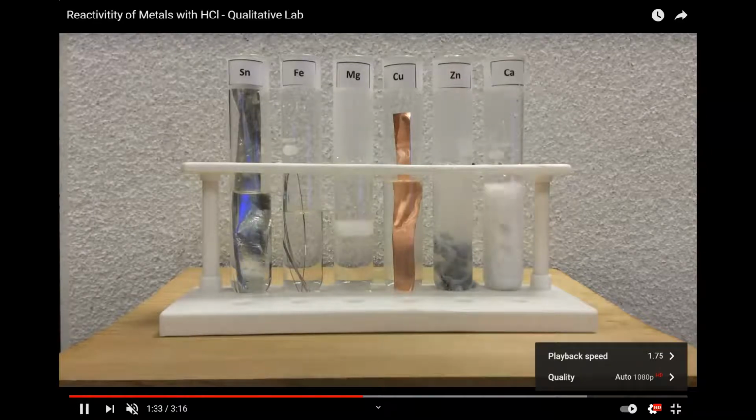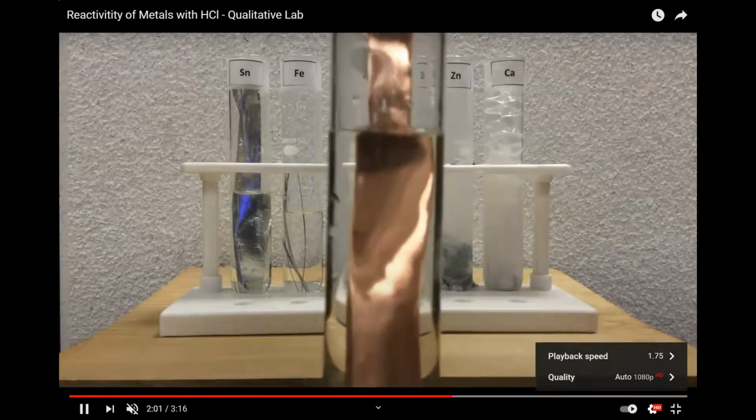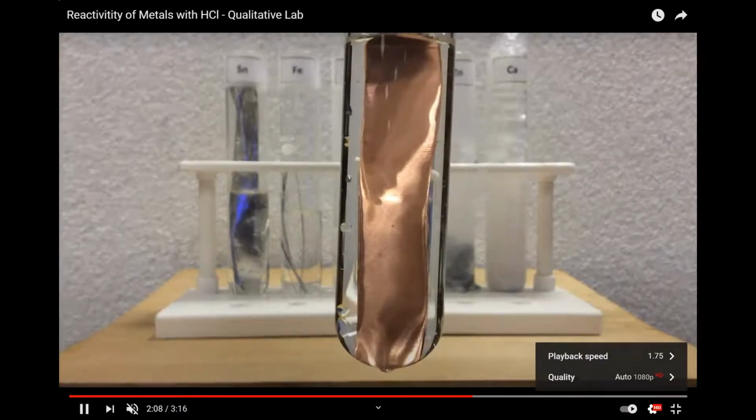And is anything else happening? I'm thinking that I'm seeing some... Oh, the magnesium is completely gone. It's totally gone. So that's interesting. Oh, there's the zinc getting going. As it warms up, it starts reacting a bit quicker. Let's have a look at the copper. Nothing. Absolutely nothing.